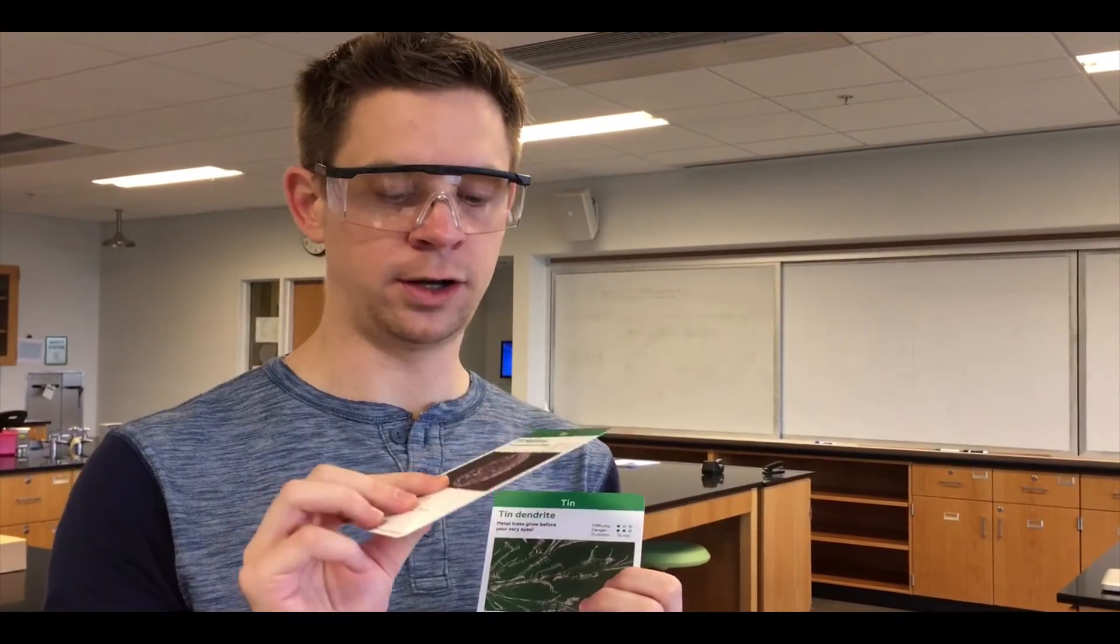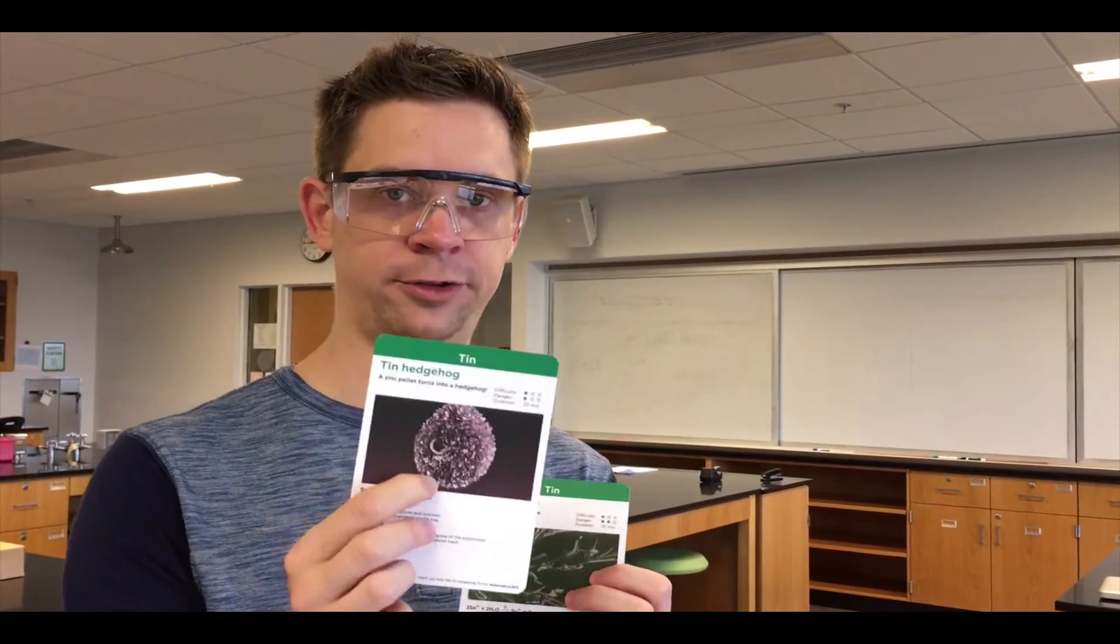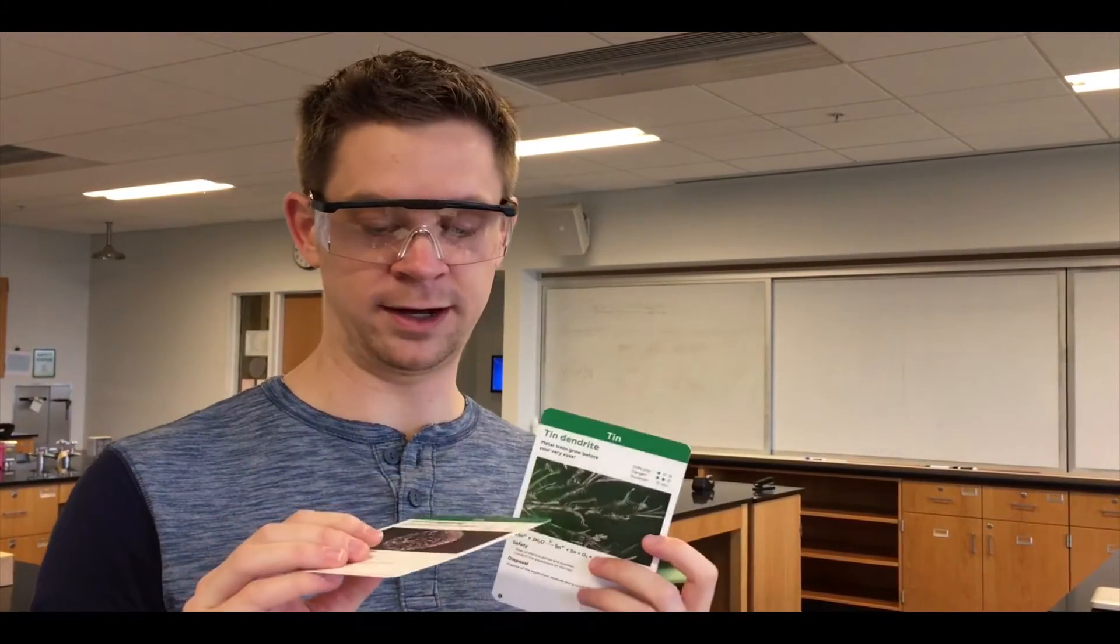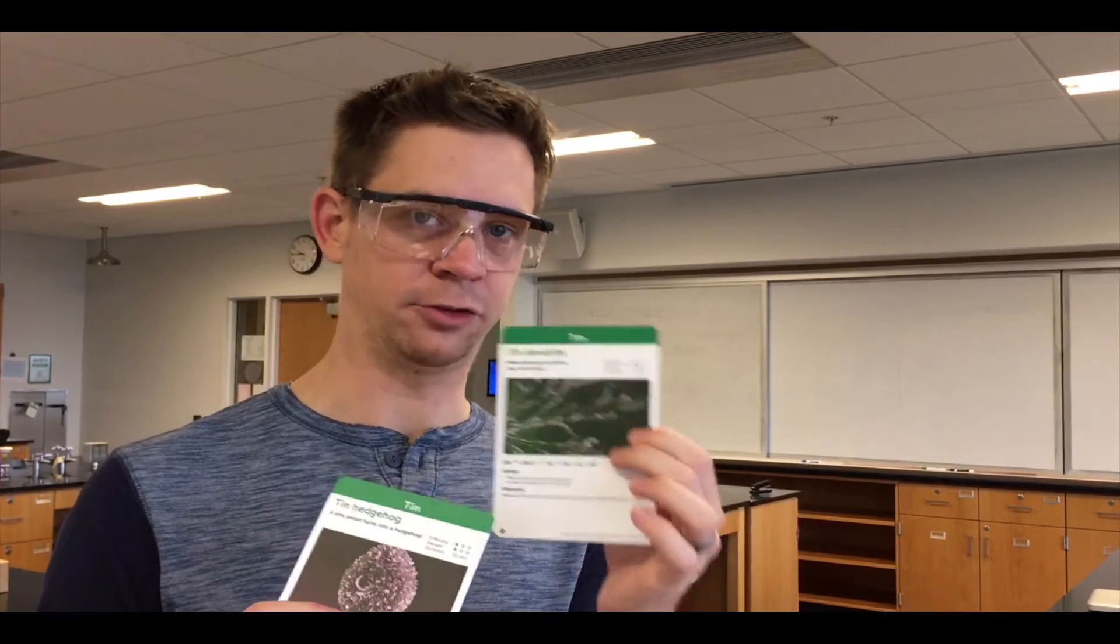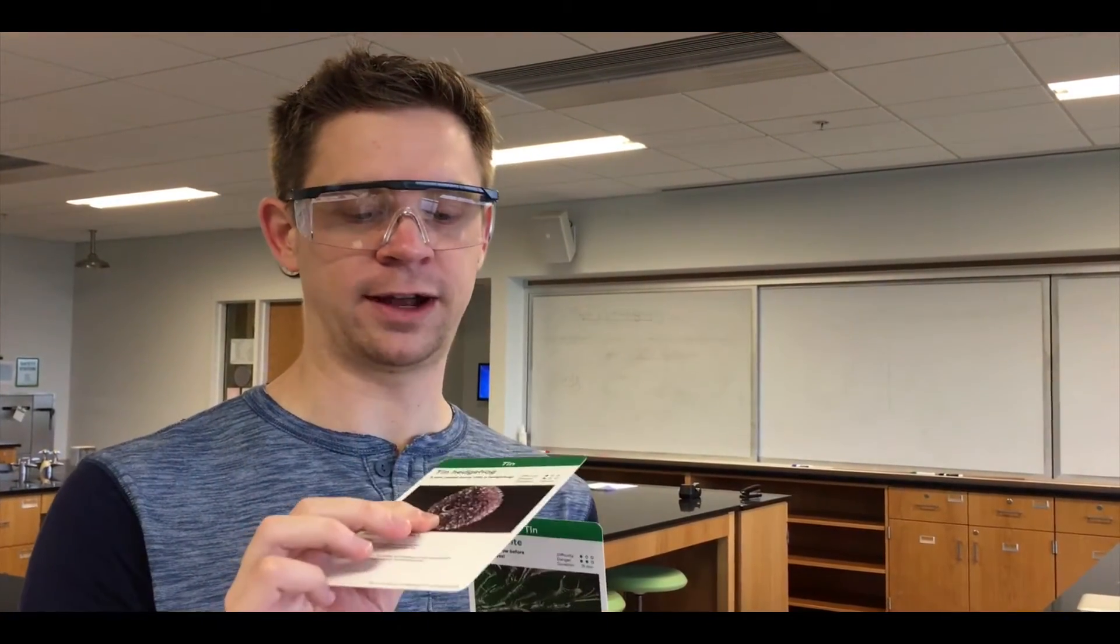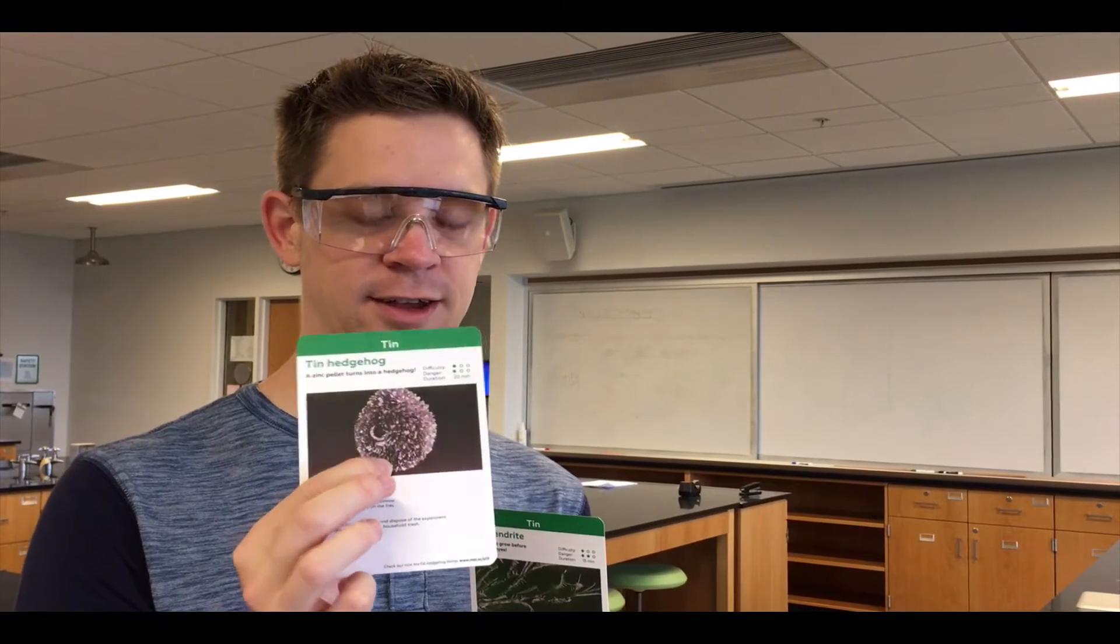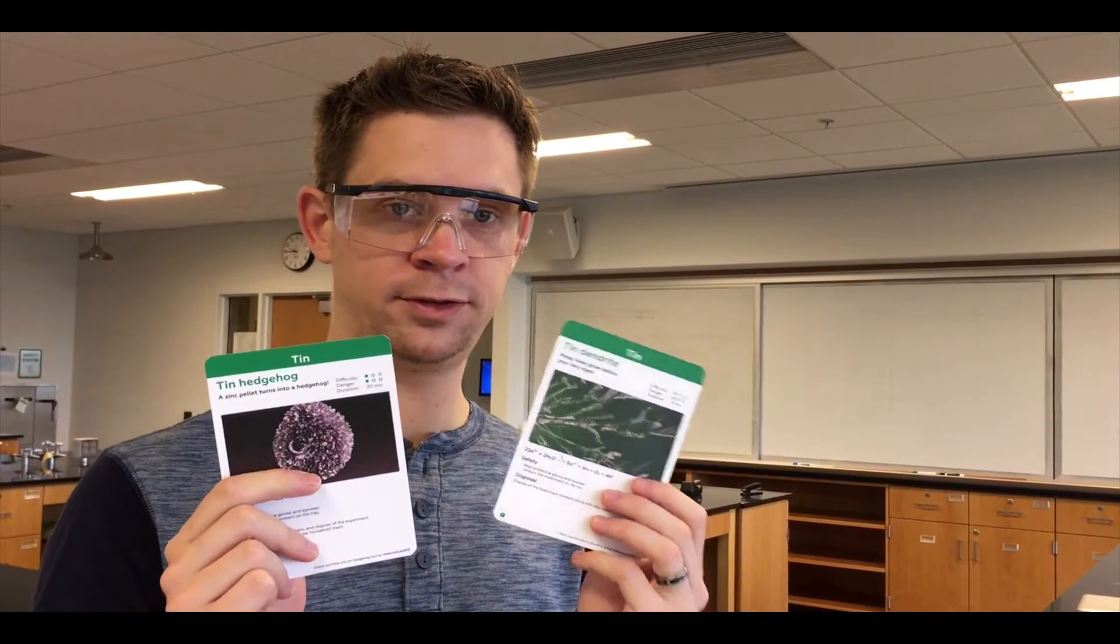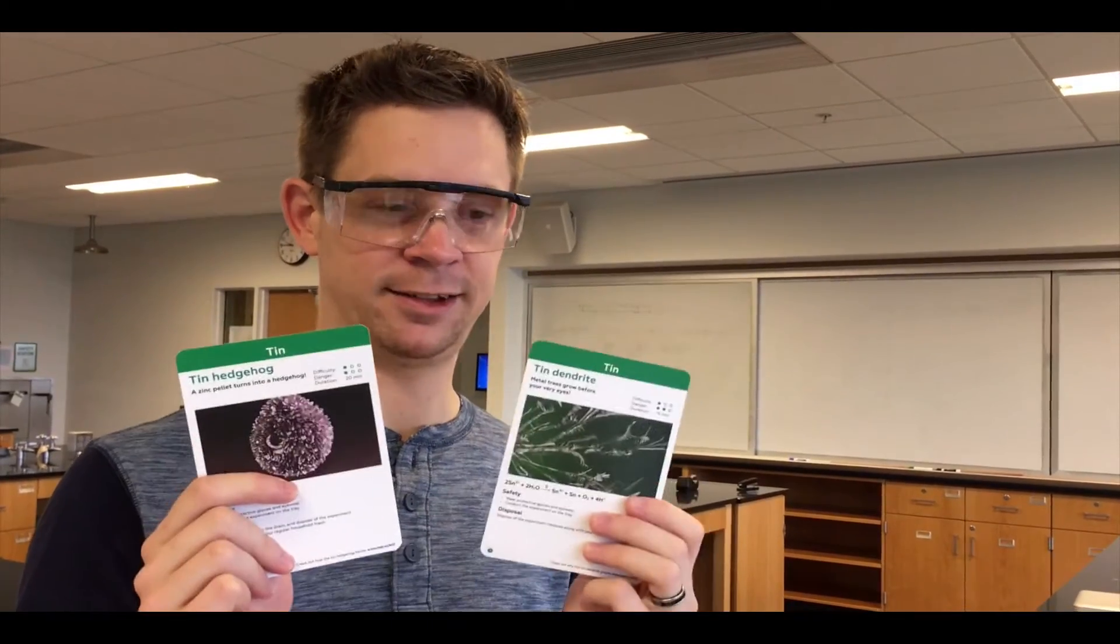In the tin hedgehog we were producing tin metal also in a slightly different way. Instead of using electrical power like we did right here to force the electrons through, we use the electrons inside the zinc metal to actually drive the process. So a good way to make metals is give them electrons—that's the lesson of this kit.